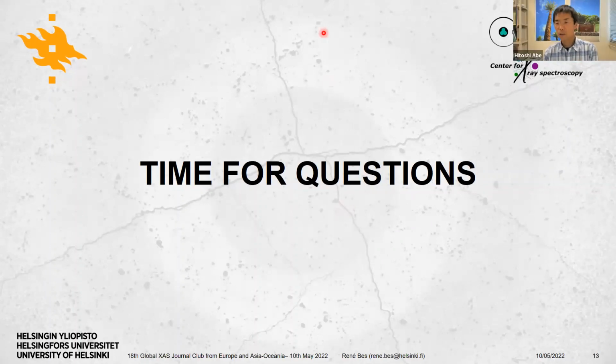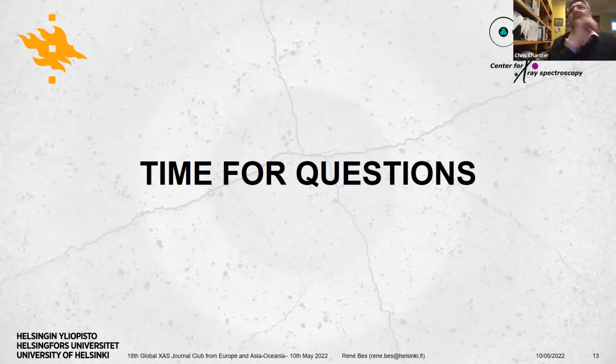Okay, thanks. Any questions from the audience? Hi, Toshi. Yeah, go ahead. Hi, René. A good talk, interesting. So the increase in resolution with HERFD is obviously quite useful and significant, but it's a long way away from where FDMNES is maybe correct or maybe approaching. So maybe that's in the second half of your talk, of course, but I just wanted to say both of those are really interesting and complex issues to look at.